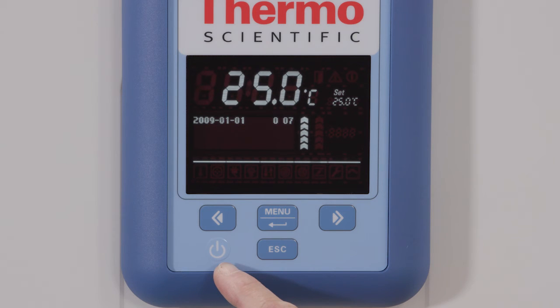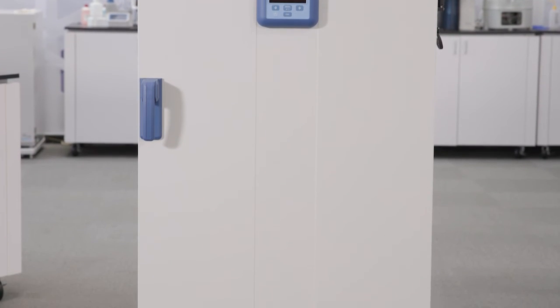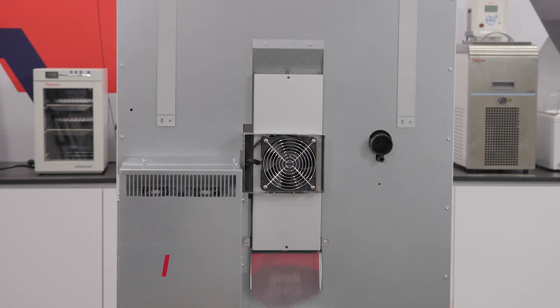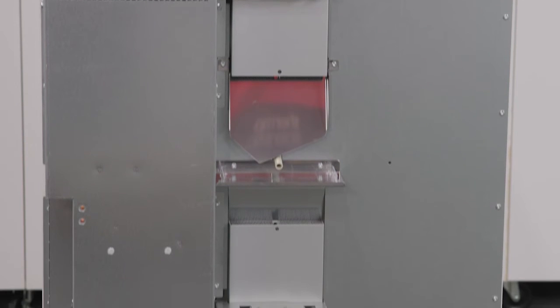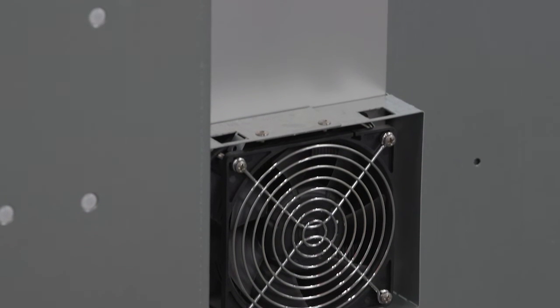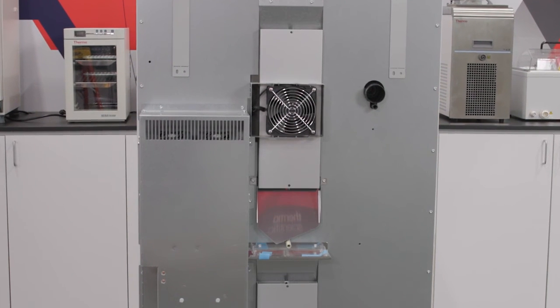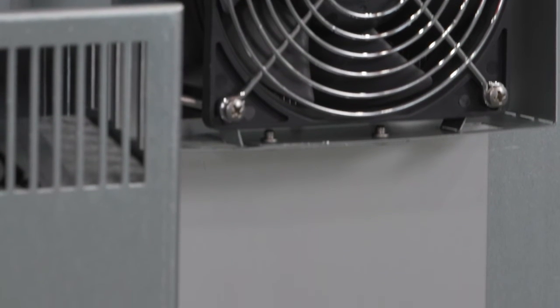For further information, please refer to the user manual included with your unit. Now that your incubator is installed, let's review some benefits that the Heratherm refrigerated incubator provides your laboratory. At the back of the unit, you will see the two Peltier modules used to maintain temperature. Peltier technology requires low energy consumption, particularly in the range of 15 to 25 degrees C, and never requires defrosting. The thermoelectric technology also enables temperature uniformity and stability with minimal vibration disruption, with the only moving part being the fan to optimize temperature distribution.